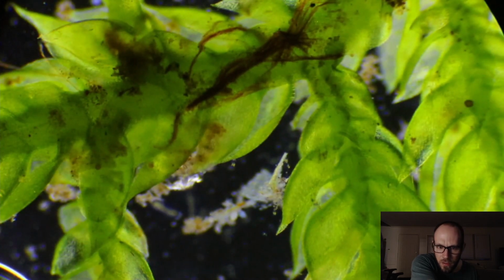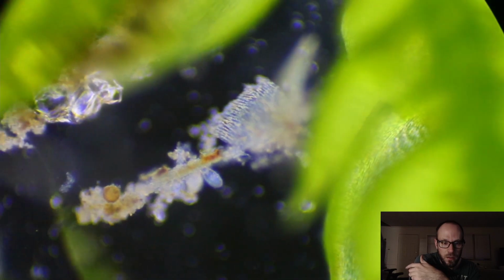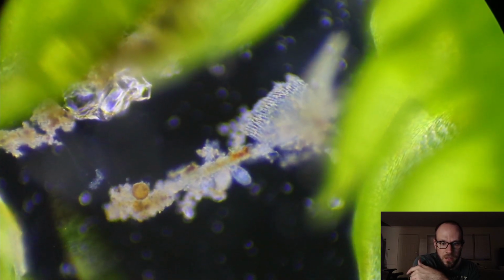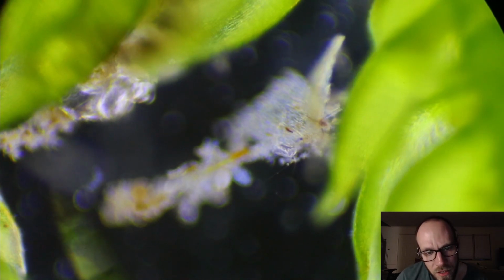Why are you moving? Oh, that's why. There's a dude hiding under there. Let's find the dude. Look at that. There he is. And what's nice is, since everything is translucent, you can really get something in view. I'm pretty sure that's another rotifer we're looking at. Just kind of squiggling around there. Yeah, that looks like a rotifer to me, especially with the way he kind of claps back like that.